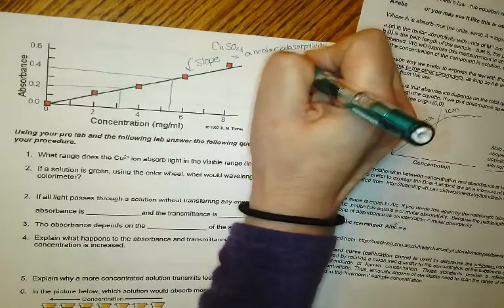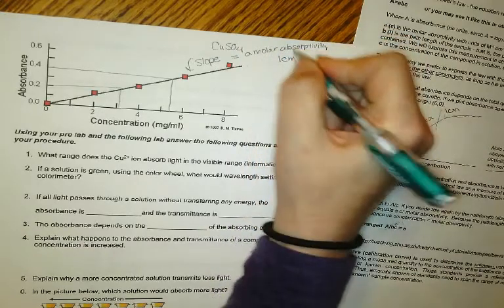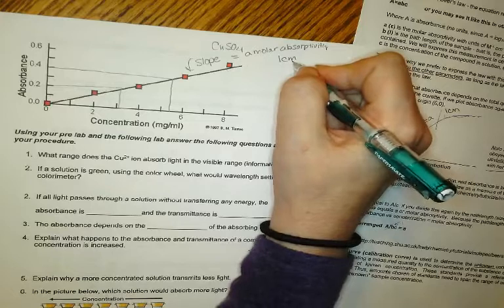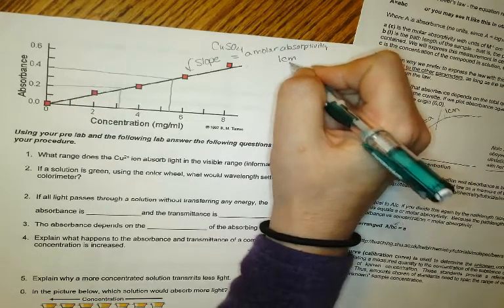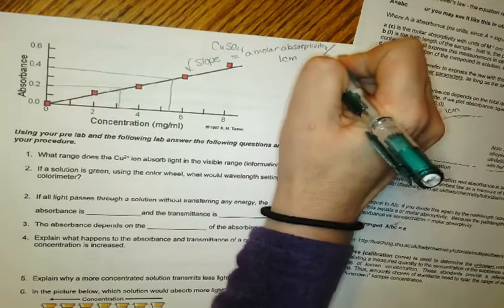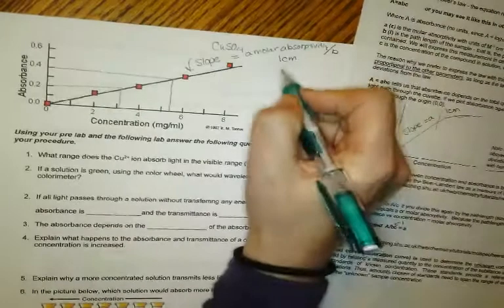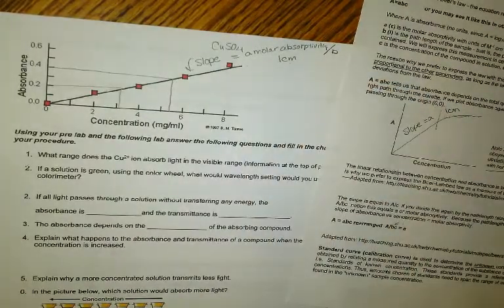If I have a 1 centimeter cuvette, okay? Otherwise, I'd have to take the slope and divide it by whatever my cuvette was, okay? Molar absorptivity divided by path length, which is B, okay? But here my B is 1, so my slope equals my molar absorptivity.